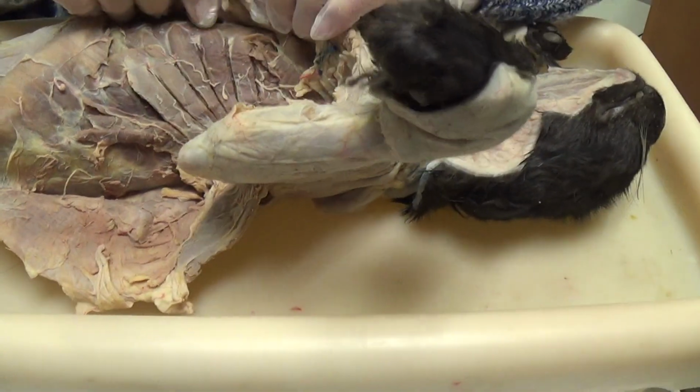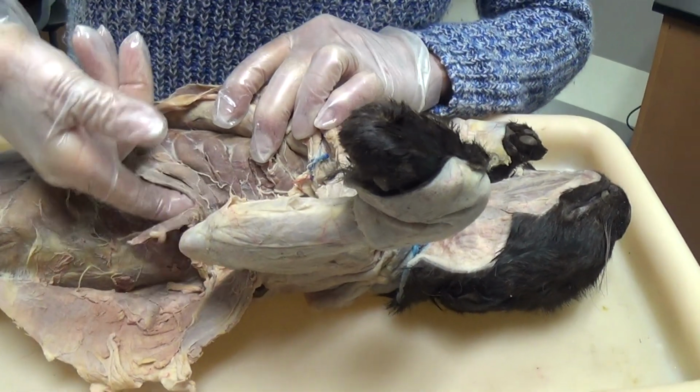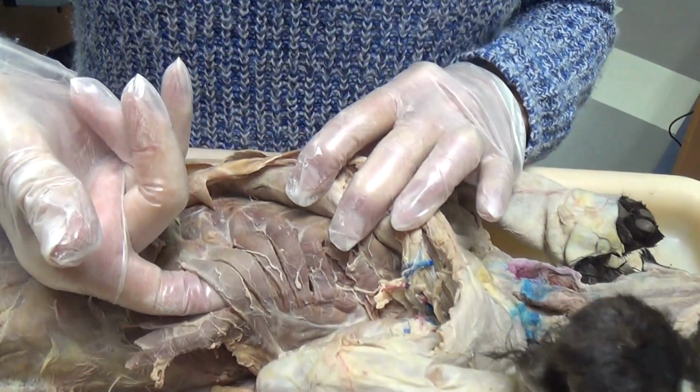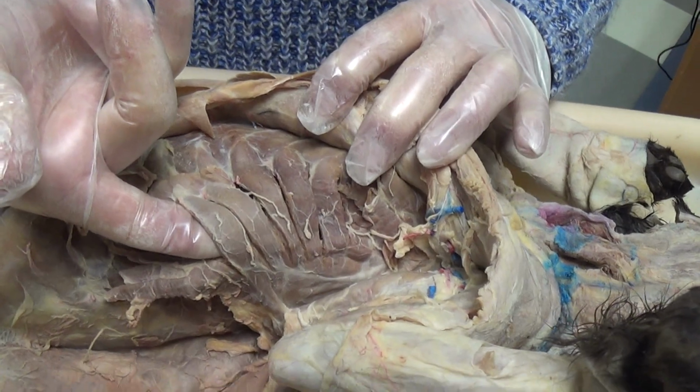Okay, serratus ventralis. This is the fan-shaped muscle. You have to cut the pectoralis out of the way. It originates on the ribs, inserts on the scapula ventrally, and it pulls that scapula ventrally.